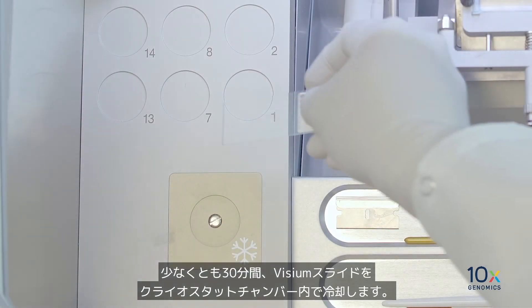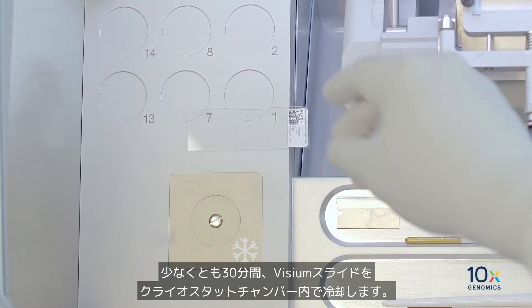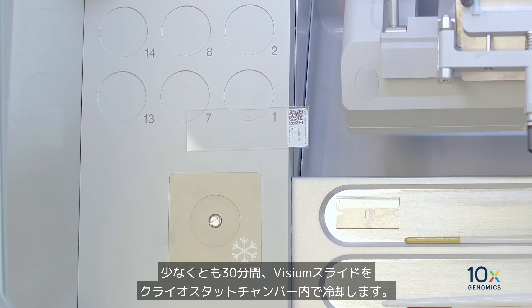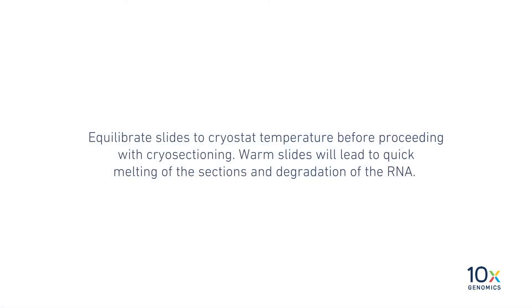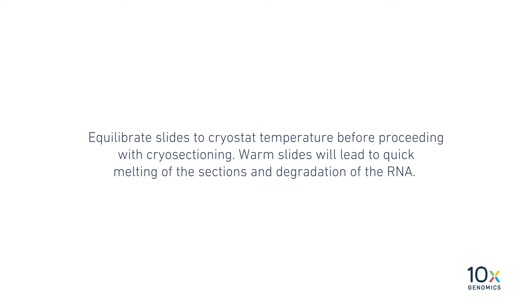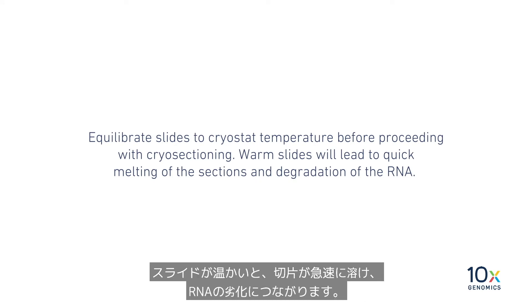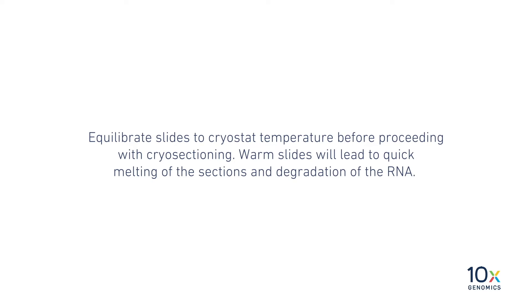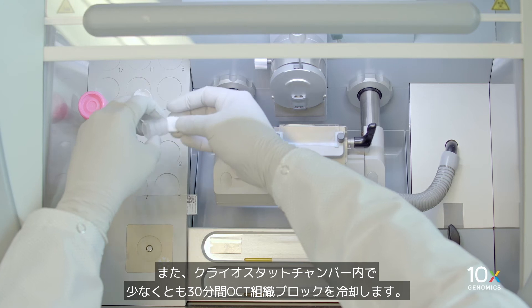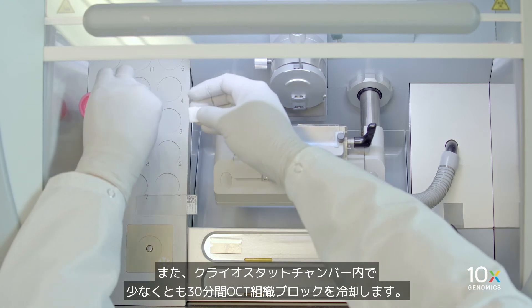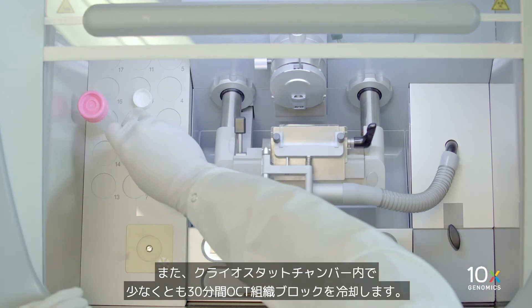We have the Visium slides, which have been cooled down to the cryostat chamber temperature for at least 30 minutes. Equilibrate slides to cryostat temperature before proceeding with cryo sectioning. Warm slides will lead to quick melting of the sections and degradation of the RNA.